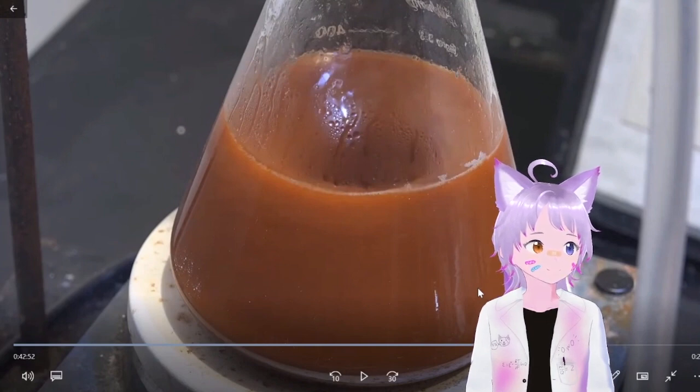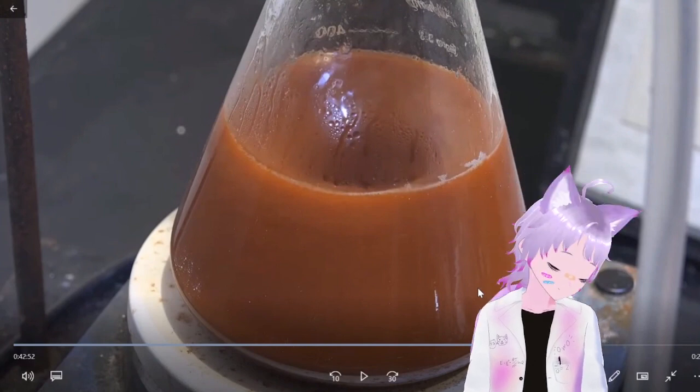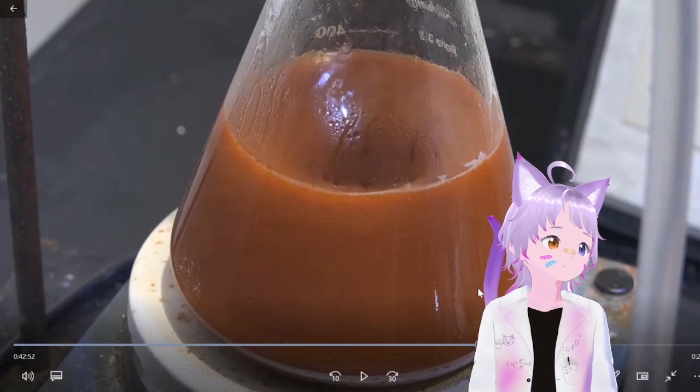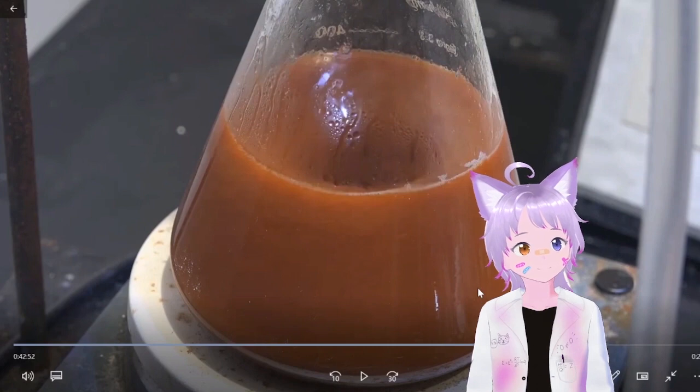And also adding boiling chips helps. In either way, I also have something called an anti-foam adapter, like a splash trap. Oh yeah, that's good. Or even a chromatography reservoir above it, so whatever foam rises up, it has an extra 500 mil of space to go.